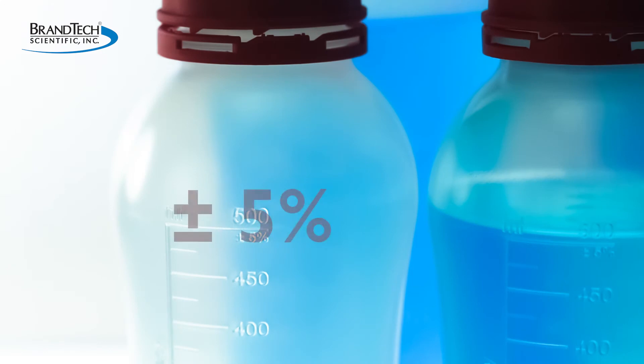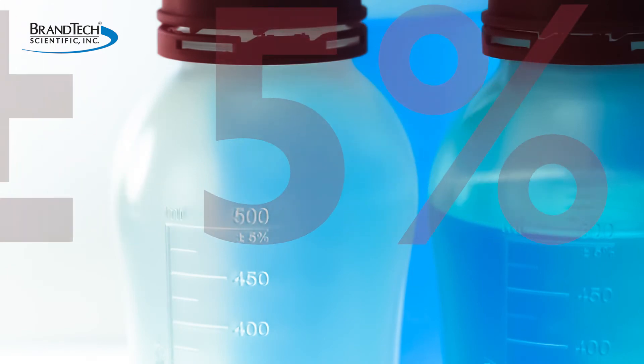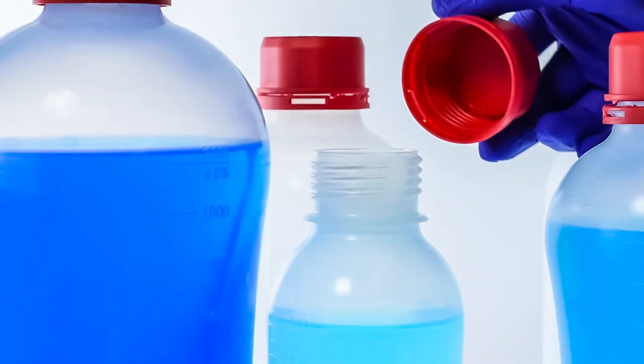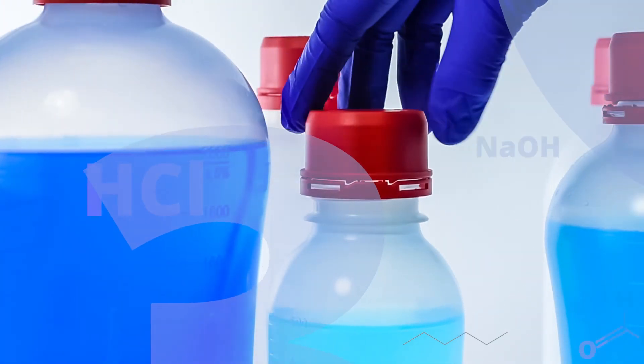The VitGrip bottle also features accurate graduations of plus or minus 5% on both sides for easy viewing. The bottles and caps are made of polypropylene which are chemically resistant and durable.